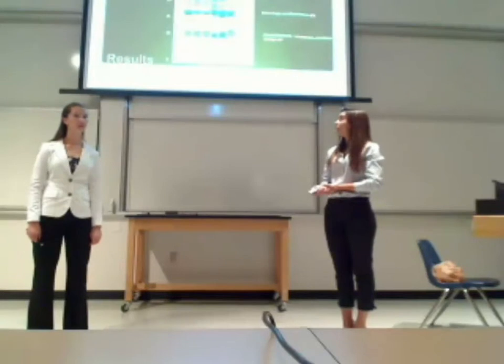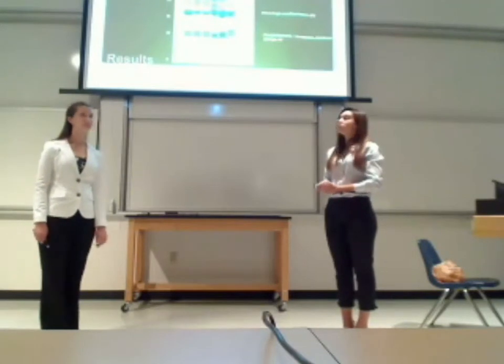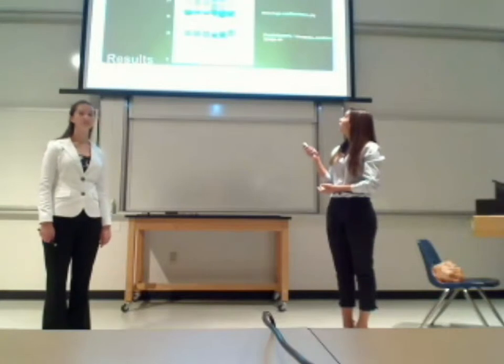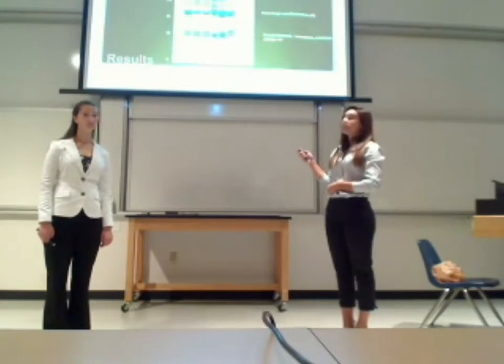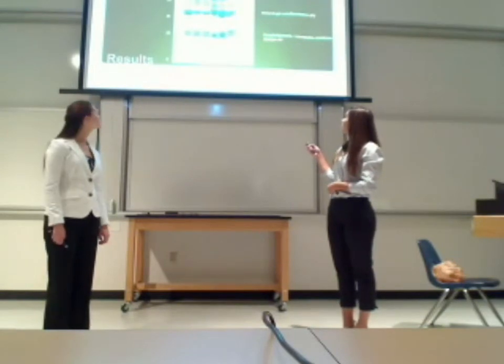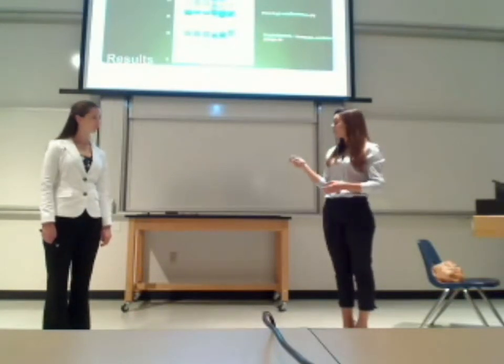Okay, so this is a gel electrophoresis picture of the crude venom that we looked at. It shows 3 specific individuals from the Crotalus aquilus species: individual 34, individual 37, and individual 38. In rows, it shows the proteins associated with that individual, starting with P3 metalloprotease, and then going on to P1 hemorrhagic metalloprotease, as well as phospholipase A2, which is a neurotoxin and is harmful to cell membranes.